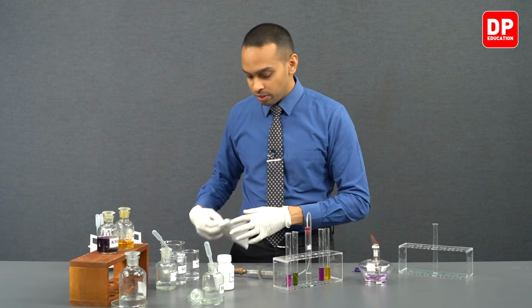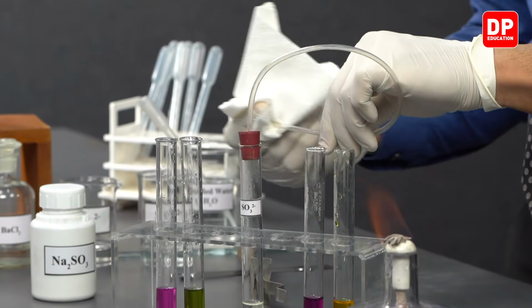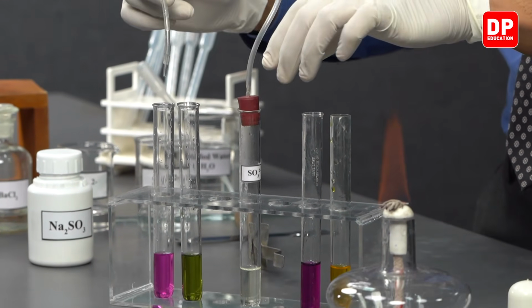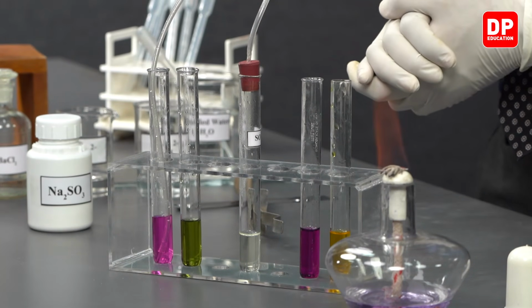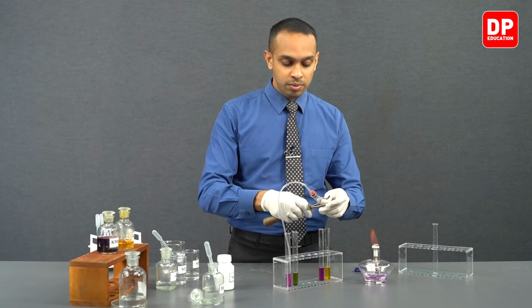In this case, the purple color will turn colorless. Before using the delivery tube again, we will wipe it, as it was introduced into our potassium dichromate solution earlier. Now, after wiping it clean, we can introduce it into the acidified potassium permanganate solution. And now let's heat up the mixture.